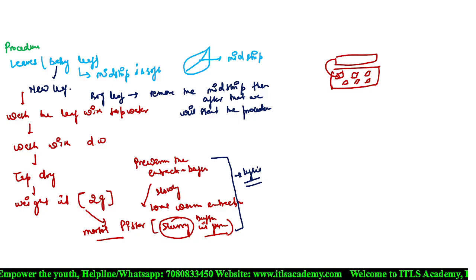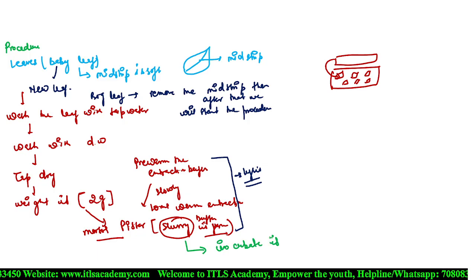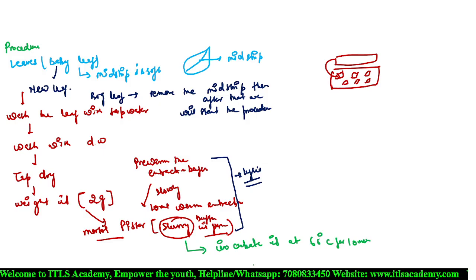That's why it is known as lysis. Then after that, you have to incubate it at 65 degrees Celsius for 10 minutes in a water bath.